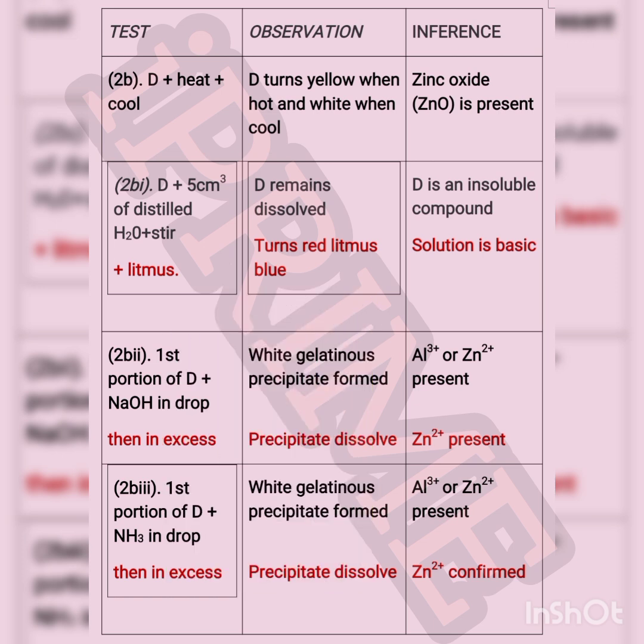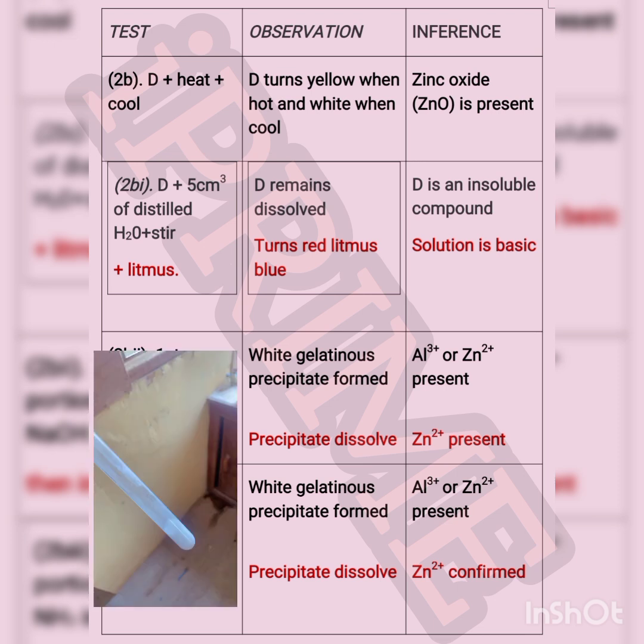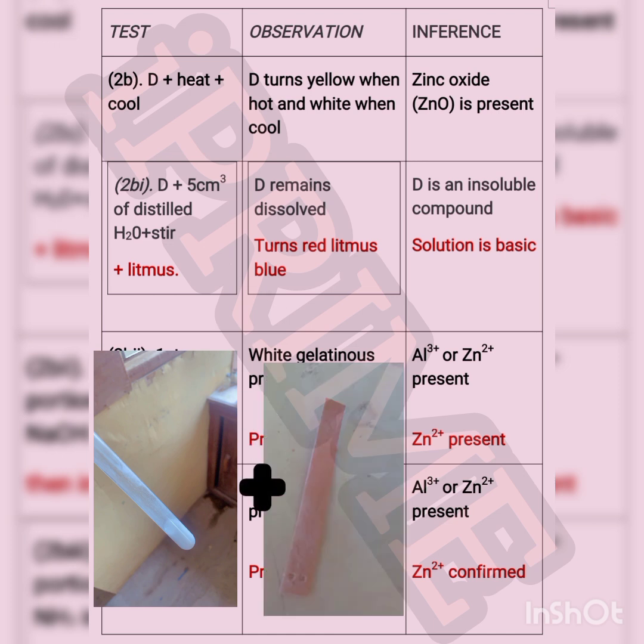Okay, before we divide it into two, we should have the observation of testing D with litmus.